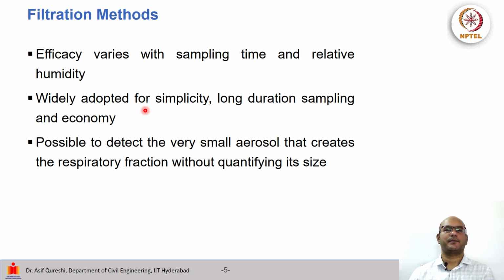So it is widely adopted for simplicity, for long duration sampling, and also for economy. One would probably need electricity, but otherwise the sampling assembly can be kept and used for a long period of time, so that sufficient bioaerosols are filtered into the media.